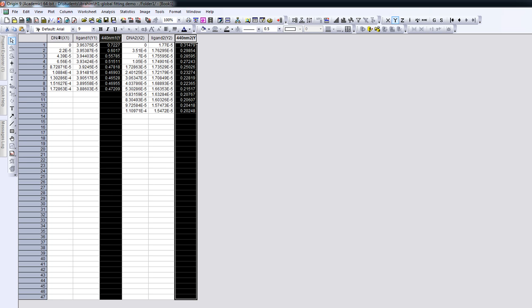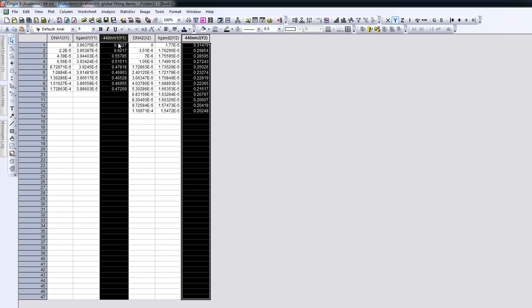we have the DNA concentration as column X1, and then the ligand concentration as column Y1, and the absorbance at 440 nanometers as Y1 as well. So ligand and absorbance are both connected to the X column. By the introduction of a second X column here, ligand 2 and the absorbance at 440 nanometers also correspond to these X axes.